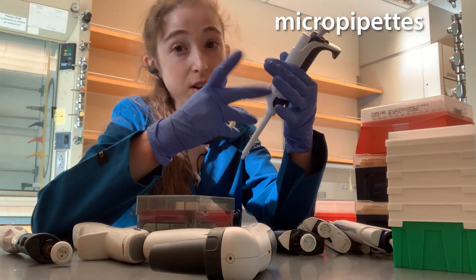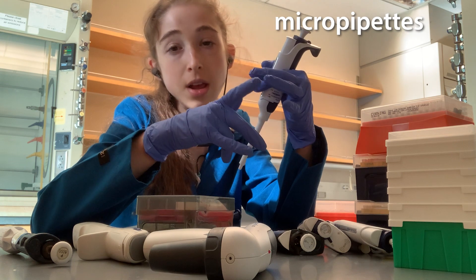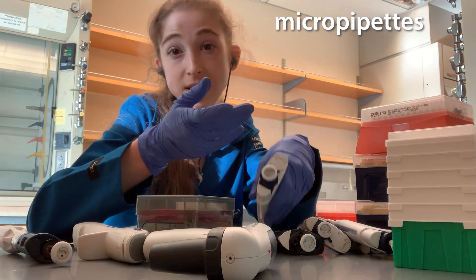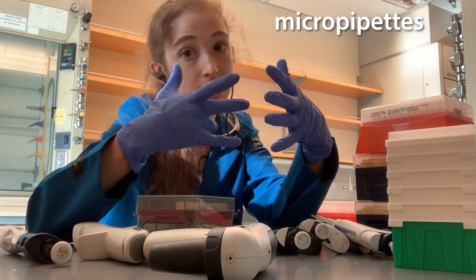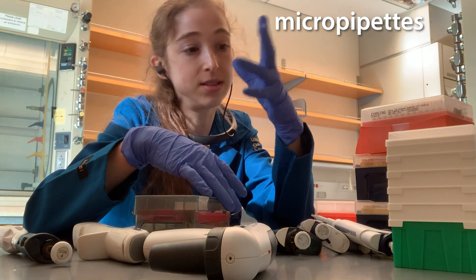A common set you'll see is a P2 — those are more rare, but very helpful if you're doing small volumes — a P10, P20, P100, and a P1000, which is a mil, because a microliter is a thousandth of a milliliter and a millionth of a liter. So those are kind of the common sizes you're going to see.